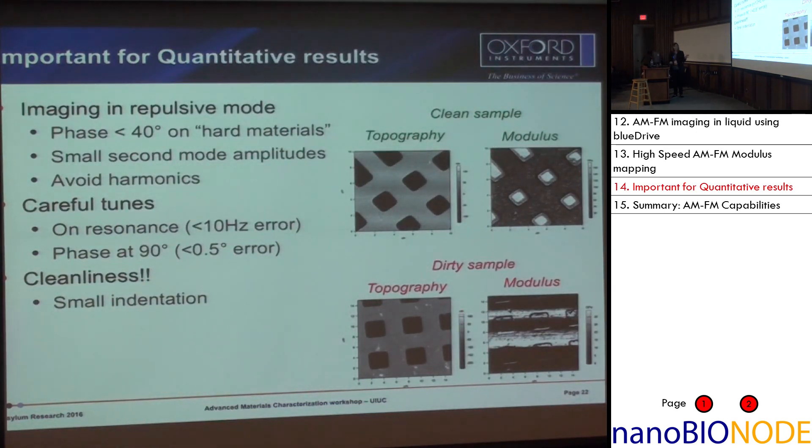One important point — this is a tapping mode technique so we're not pushing into the surface very much, which means your sample must be clean. On the top you have a clean sample — again the silicon-titanium sample. On the bottom you have a dirty sample. Even though you get topography in both cases, once you try to do modulus measurements, you need a clean sample. If not, what you're measuring is basically the thin film of dirt on your sample. There are some tricks in terms of getting your sample clean and setting your tunes exactly to what they should be, but besides that it's almost as easy as tapping mode imaging.